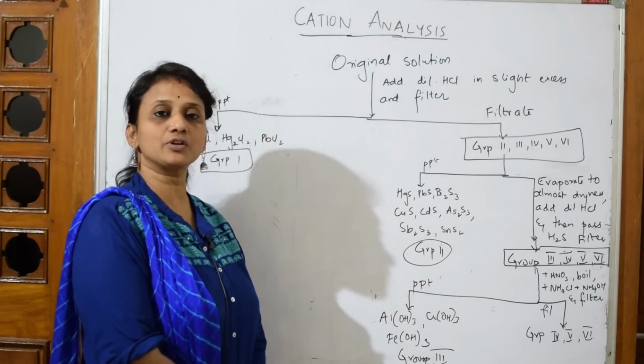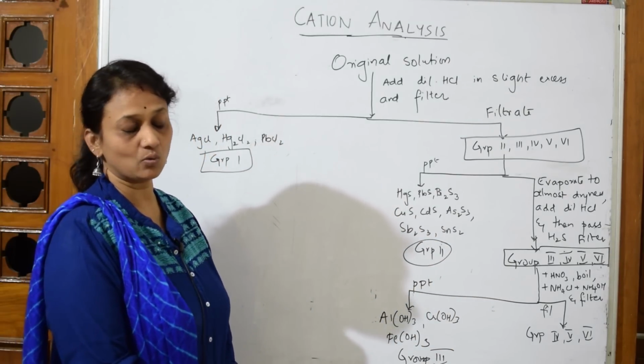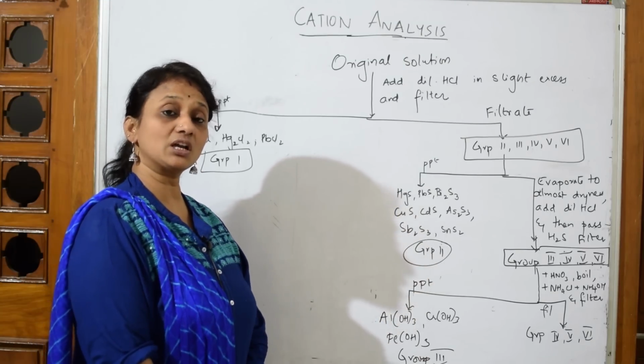The first important thing you have to remember, most of the viva questions you'll be getting from here only. What is that? See, suppose I'm the examiner. When the student comes with the confirmatory test, first the examiner asks you, what are you reporting for?